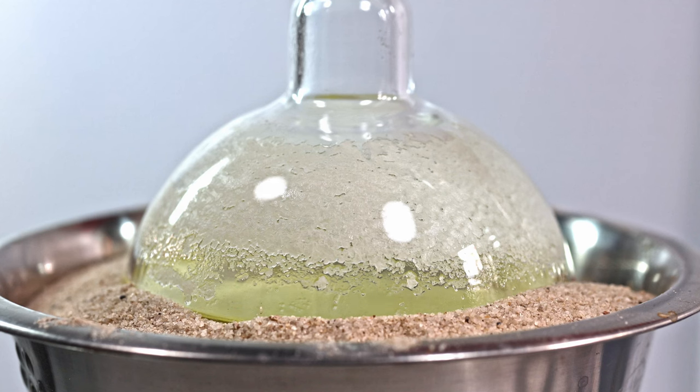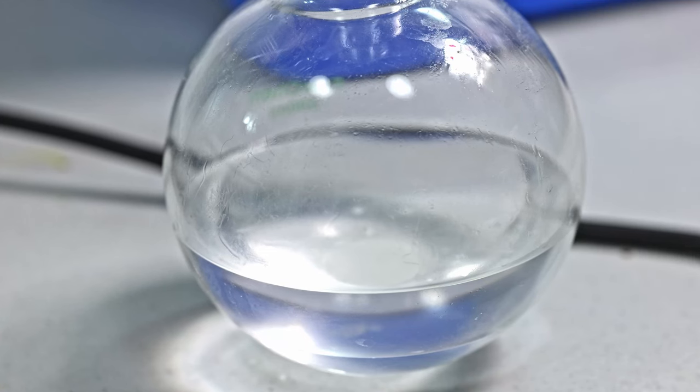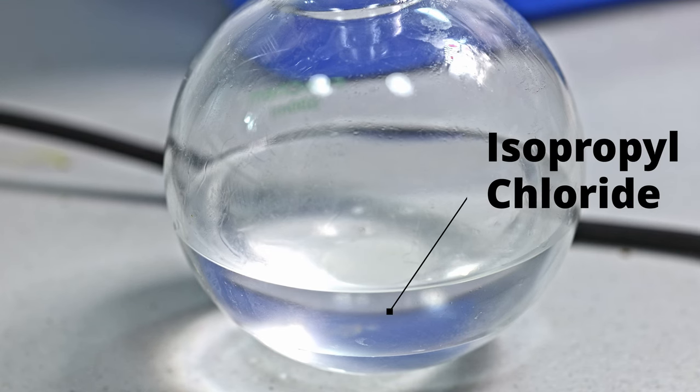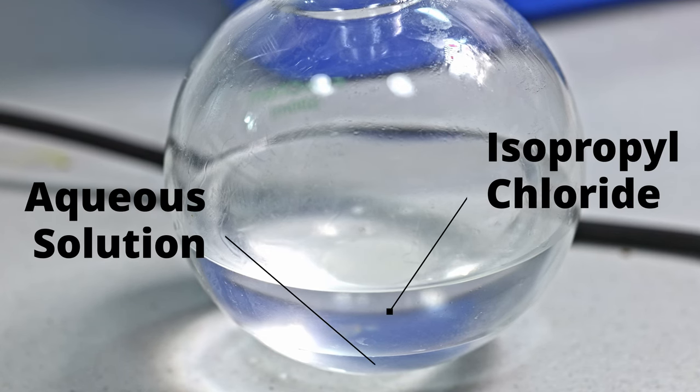Also our reaction flask has been boiling less because we've already expelled a lot of the isopropyl alcohol and turned it into isopropyl chloride, but I still believe there's more left in there. In our collecting flask we have two distinct layers. I suspect that the top one is isopropyl chloride and the bottom one is a mixture of water, unreacted alcohol, and some muriatic acid.